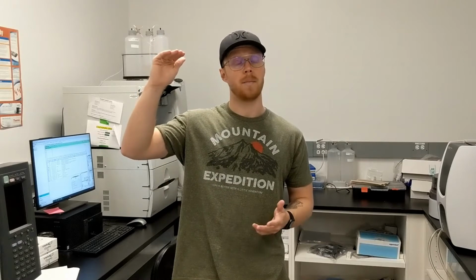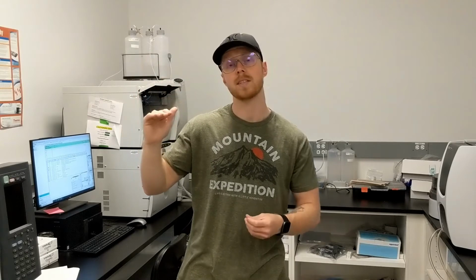When you make a calibration curve, you usually want to have one point up about as high as the instrument can measure, around 100 ppm, one point somewhere in the middle, and then a majority of them should be in your measurement range. So if you're trying to go into the parts per billion range, make sure that your calibration plot goes that low. If you're trying to measure in the middle, just make sure that your calibration covers that.